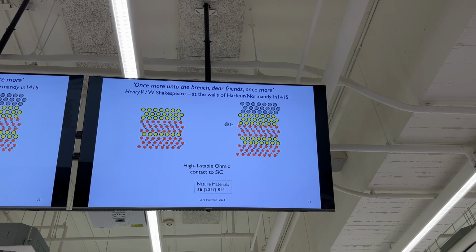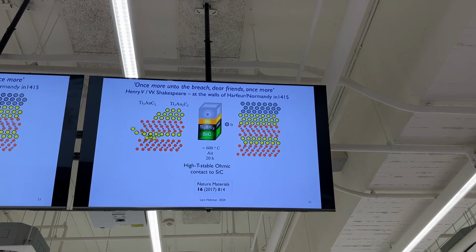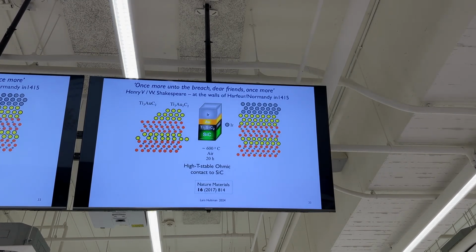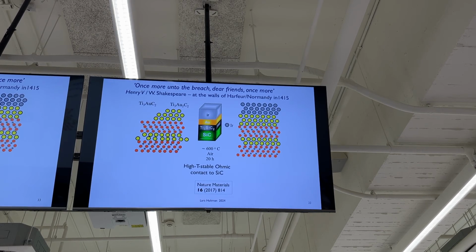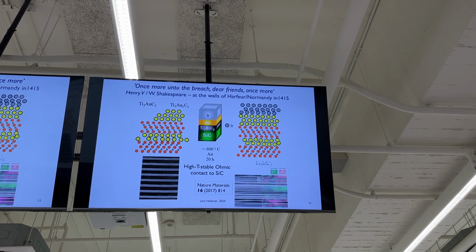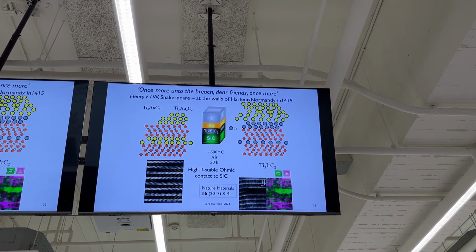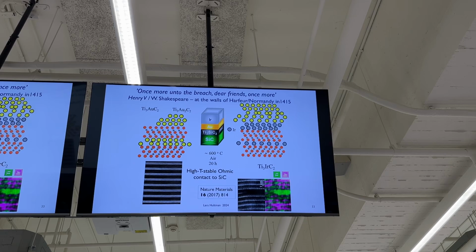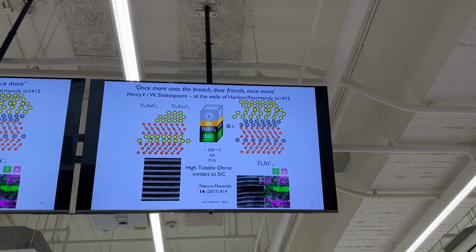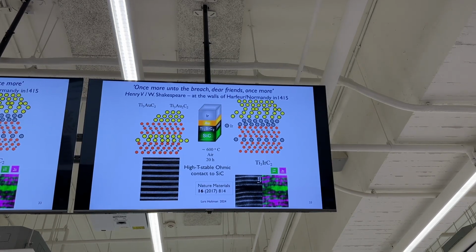We're going to anneal this. And lo and behold, what happens is that as we continue annealing, more gold goes in. I mentioned that we can form bilayers. So now we have the bilayer situation here, and we are going to anneal with iridium on top. Funny thing is that gold goes out and iridium goes back in. So we have a second intercalation, now with another metal. And you can see the contrast clearly here for the coloring of iridium in the cross-section scanning TEM image.